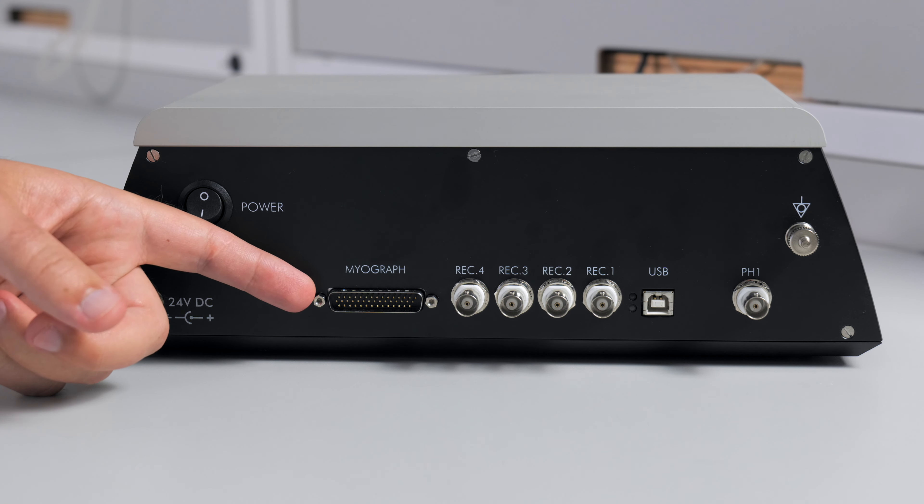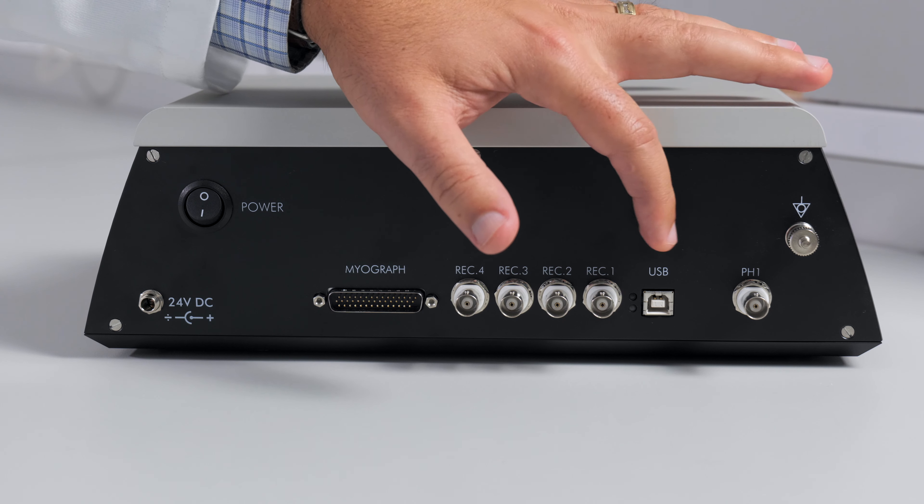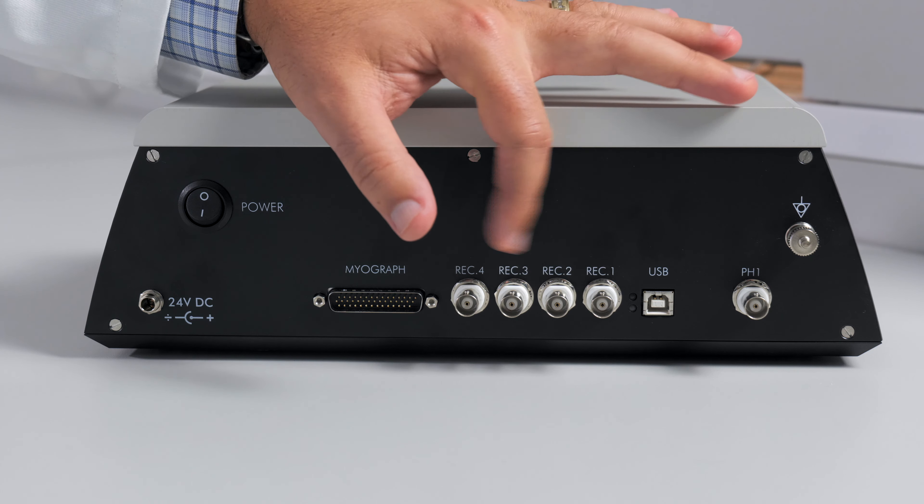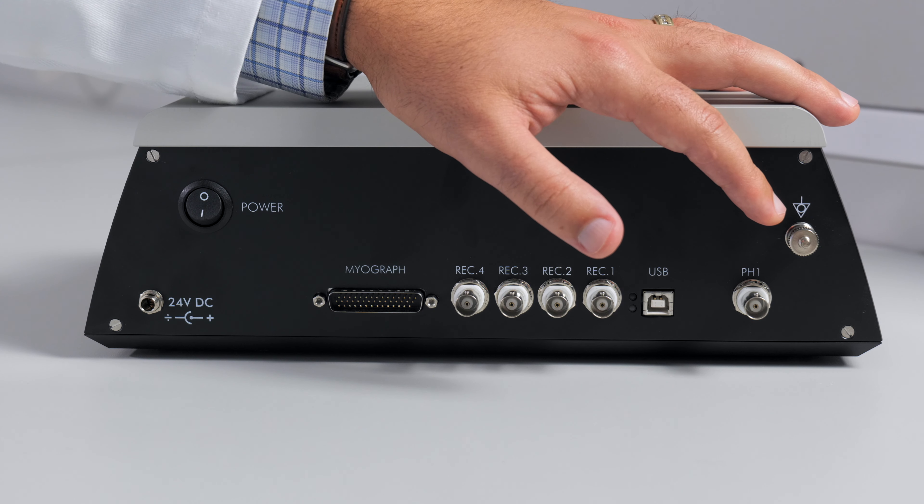There are four BNC outputs to collect the raw data from the myograph. You also have a USB connection which will allow you to bypass the BNCs in the analog-to-digital converter and go straight to your data acquisition. This is the connection for the optional pH probe. And lastly, there is a ground connection to eliminate any electrical noise.